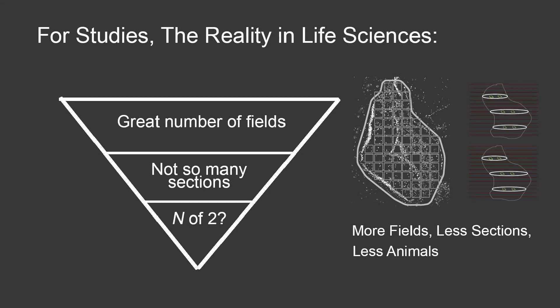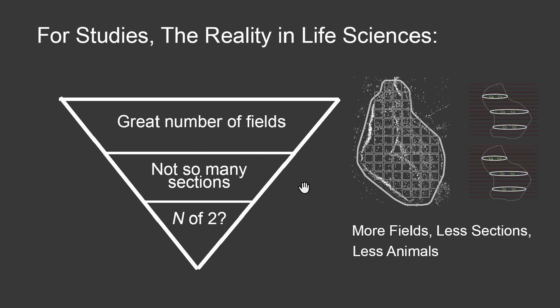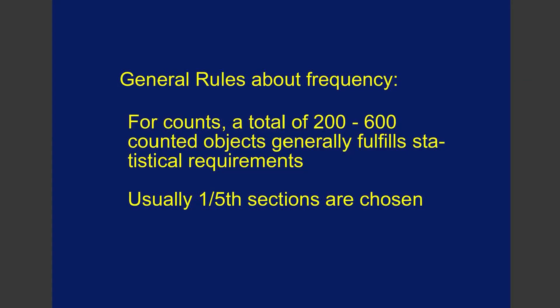Generally, in the scientific research I've seen, the idea is to get a great number of fields, not so many sections, and possibly working with only an N of two. Obviously, in biological research, it can be hard to get a lot of animals, but the mistake that's so often made is not so many sections are used, and then a great number of fields are examined. It really should be that a lot of sections are used, and then not so many fields are measured.